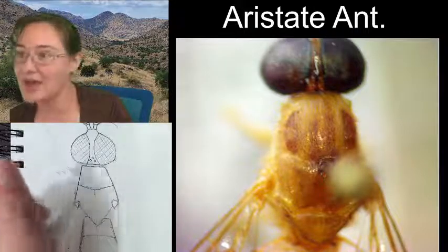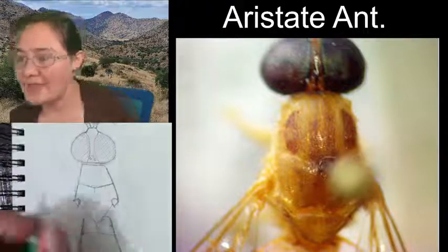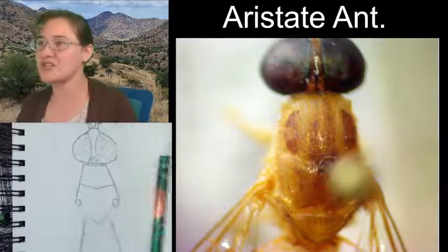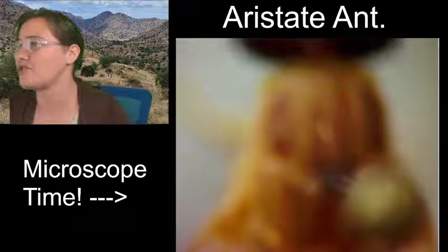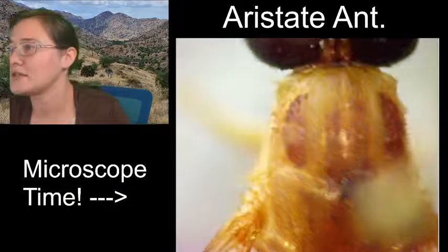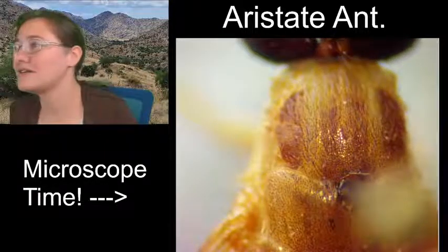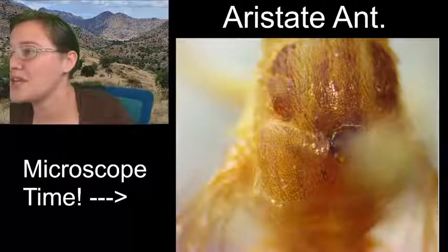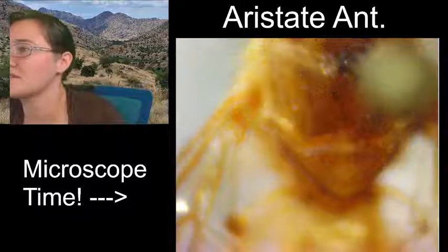I'm going to go ahead and zoom in so that we can see some of those details in the shoulders. And then, well, let's just do that now. Let's go ahead and zoom in and check out where the wings connect to the thorax. Let's do it. And we can even probably scooch this down so that we can see, yes.